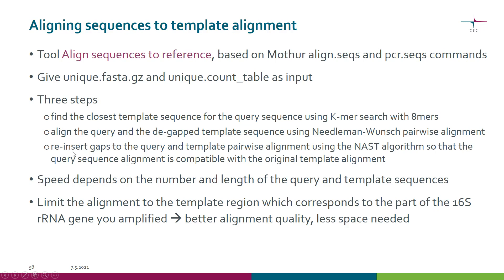The speed of this process depends on the number and length of the query sequences. You can affect the length of the template sequences by limiting the alignment to the template region which corresponds to the part you amplified. If you limit the alignment this way, you also get better alignment quality and you save space.